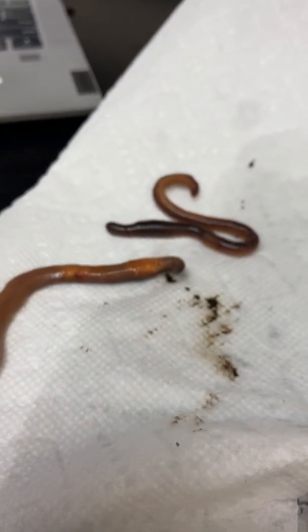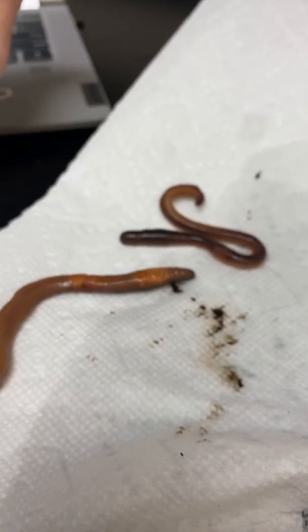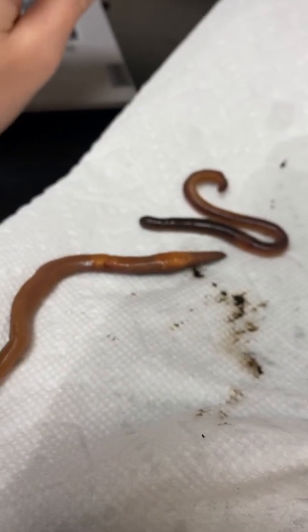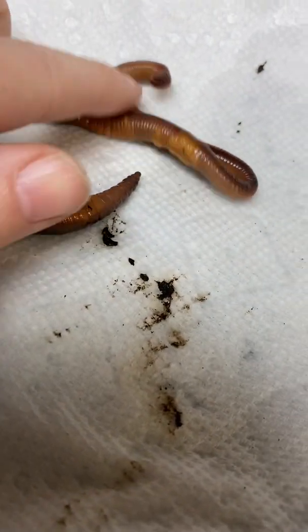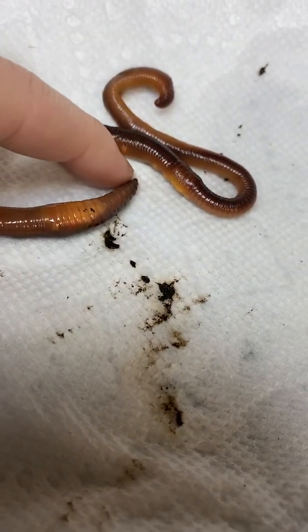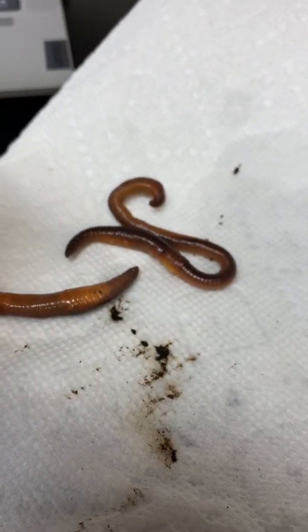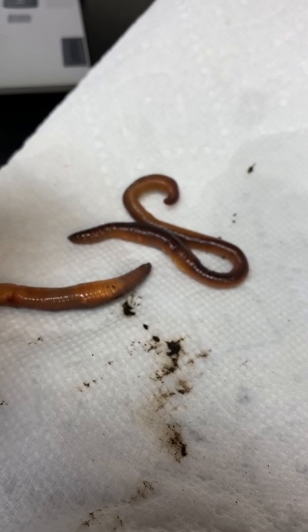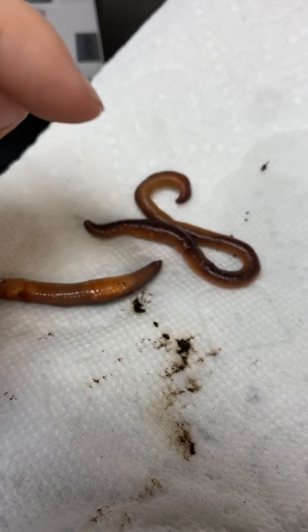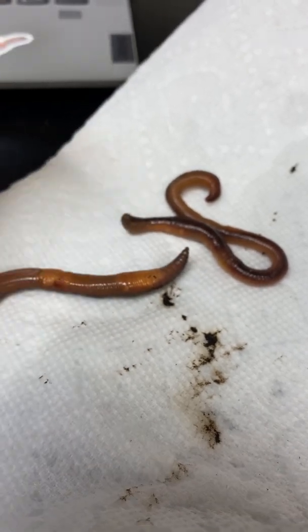Okay, the last few questions, where it says other structures, features. 31, what is the name of the lip-like structure? That is the first segment of the worm. That very first segment right there that covers the mouth, the pointed end right there, that is the prostomium. And that's from the notes. Describe the physical difference between the head, mouth, anterior end to the anus, posterior end in the earthworm. And how can you tell it apart?